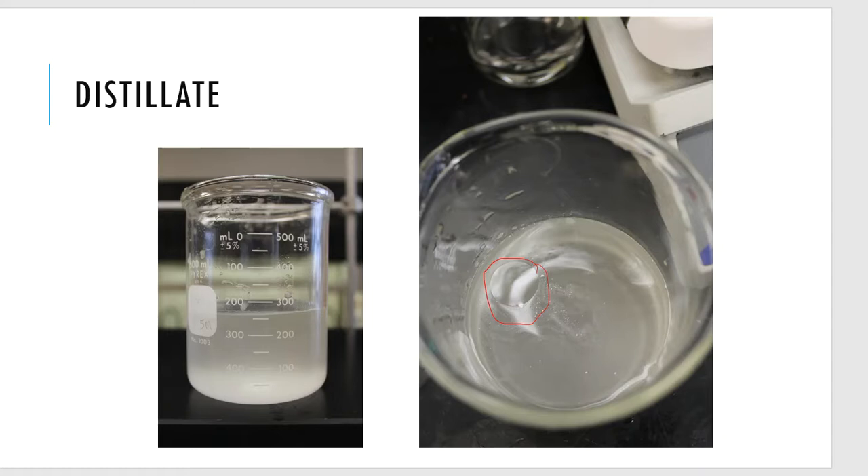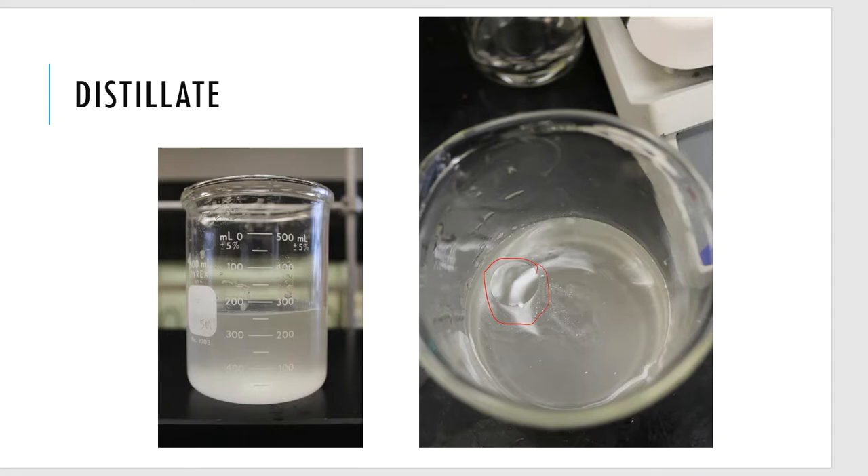Now it's my job to separate this clove oil from the water — I've got an aqueous and an organic layer. I need to separate two layers from each other, and I hope you're going to tell me: use a separatory funnel. And we do. So I'm going to pour that distillate into the separatory funnel.